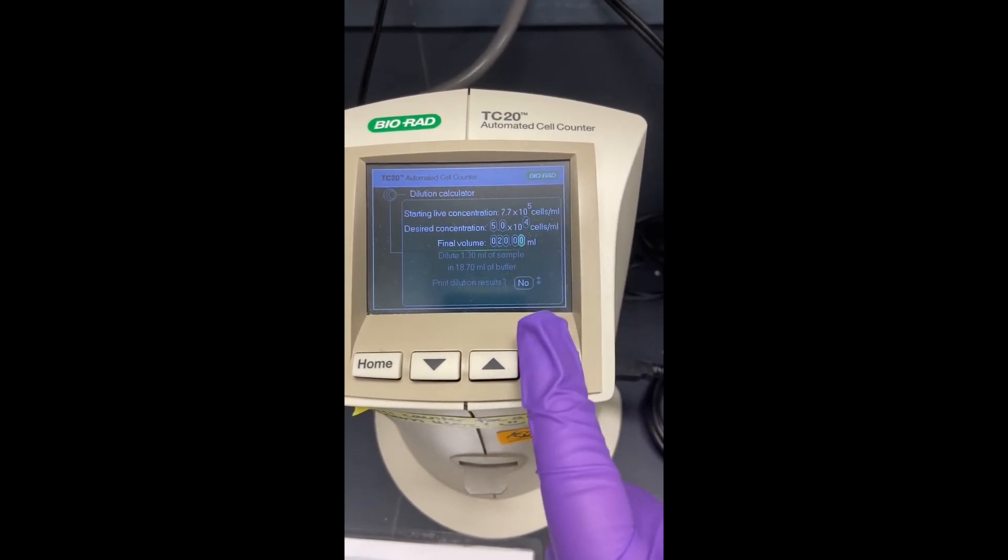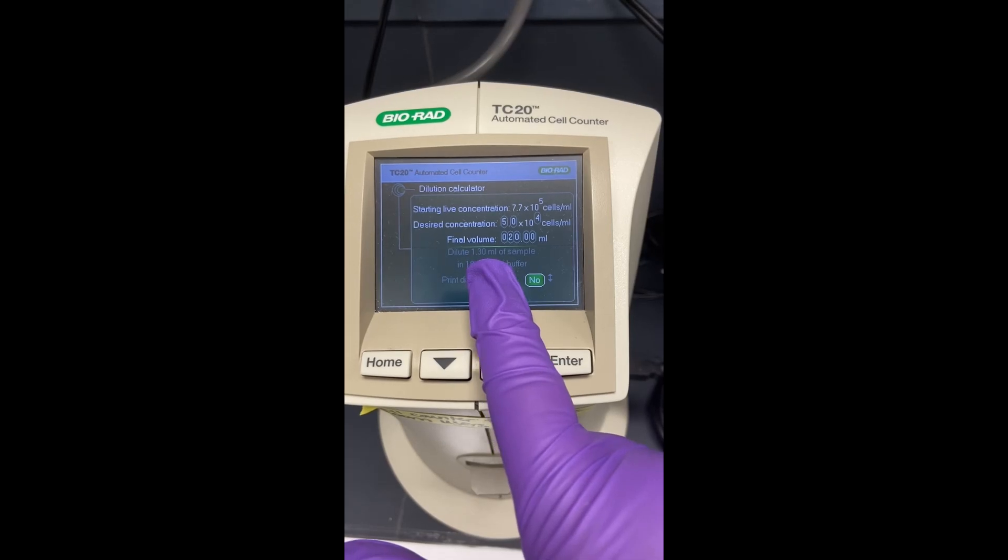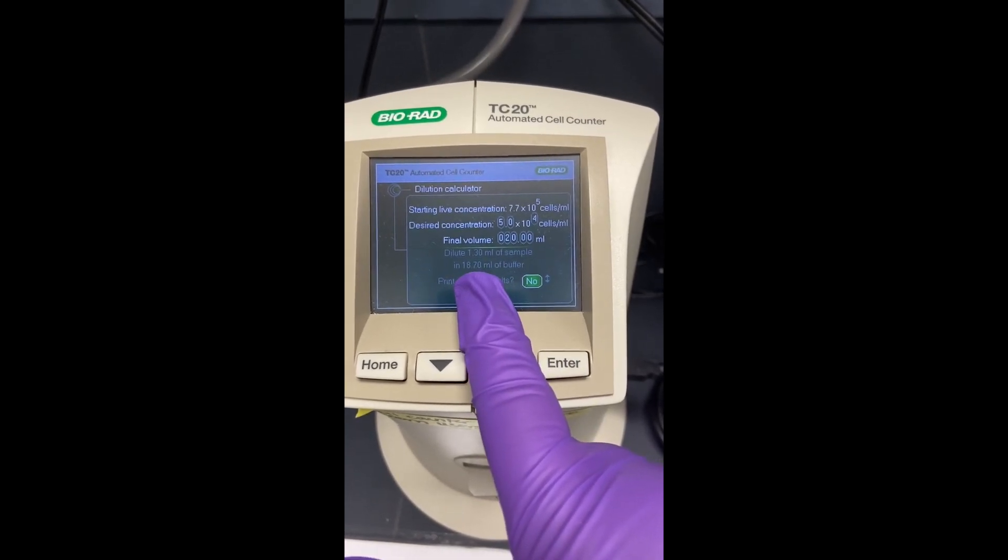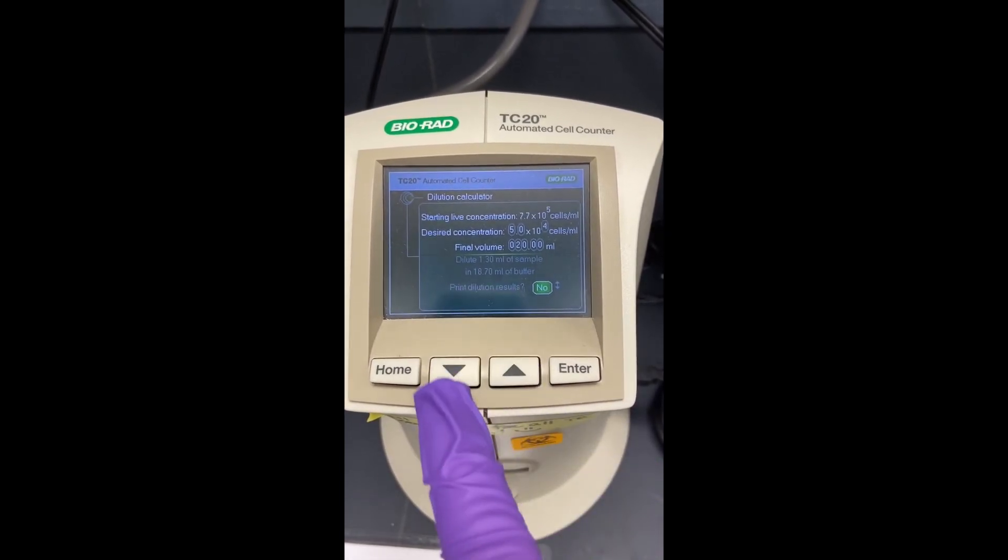And the really nice thing is that it tells you, okay, I need 1.3 mils of my cell sample and then I need to dilute it in 18.7 mils of buffer. And what this usually means is your cell culture media.